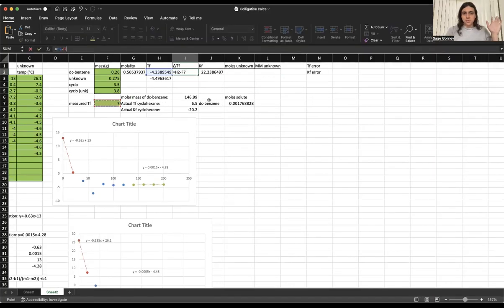Okay, so we switched something around here. Long story short, I'm not going to go into the details of why, but for comparison-wise, we need to switch something around here. Rather than doing 7 minus the measured value, or in other words, our solvent freezing temperature minus our solution freezing temperature, we're switching that formula around, and we're doing our solution freezing temperature minus the measured.